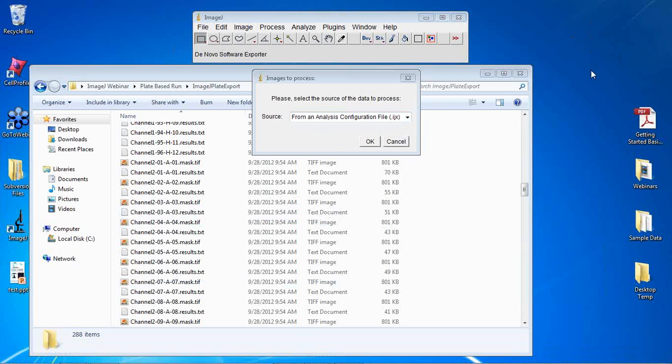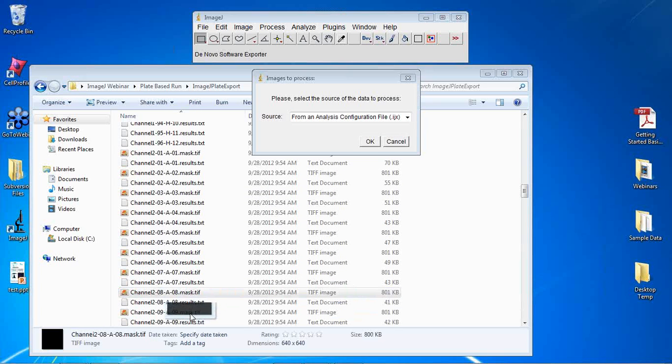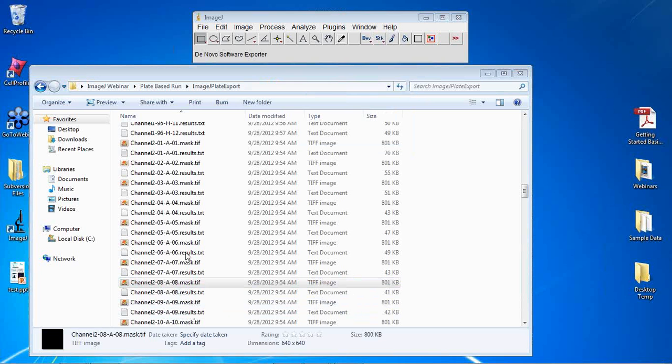So with all that being said, I wanted to take a quick break, and I wanted to ask if anybody has any questions about what they've seen in ImageJ thus far, about the ImageJ modules or macros that we've introduced. And if not, we'll go right on to using this data in FCS Express. So it looks like at this time we don't have any questions just yet. Feel free to at any time hop in and ask us a question if you have any.